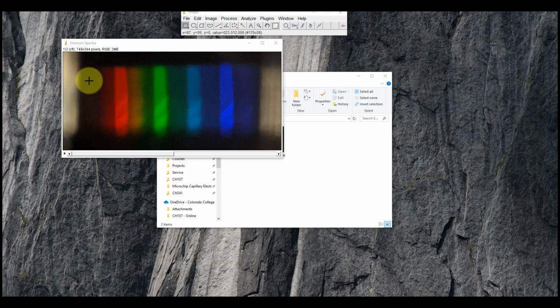So at this point, what I essentially have is a two-dimensional set of data. Actually, it's three-dimensional. I have a two-dimensional array of pixels. Those pixels correspond to the individual units of transistors inside of your phone sensor. So you've got millions and millions of them. Every single one of them registers an intensity of a grayscale, or a color in this case, but we really are only concerned with the grayscale. So you can imagine this is a three-dimensional image. We have an X and Y plane, that's the sensor, and the third plane coming into and out of the screen is the intensity or the brightness of each of those pixels. The brightness of each of those pixels is what we want to extract, because that's essentially the intensity of this spectrum.